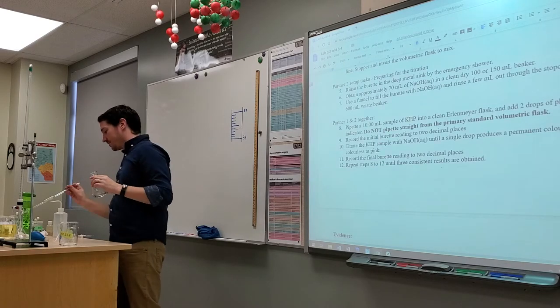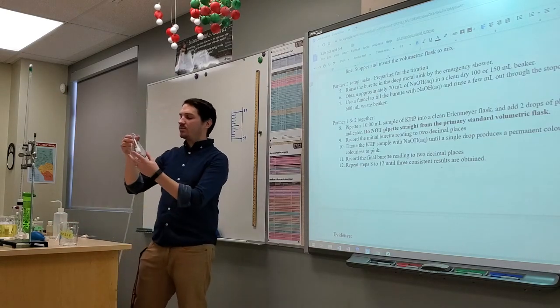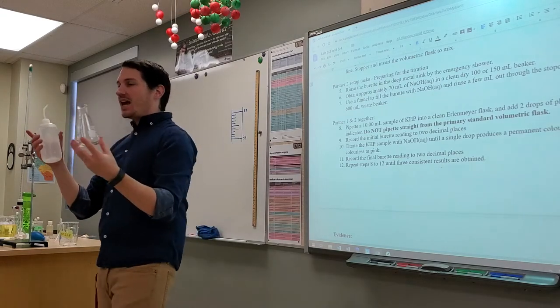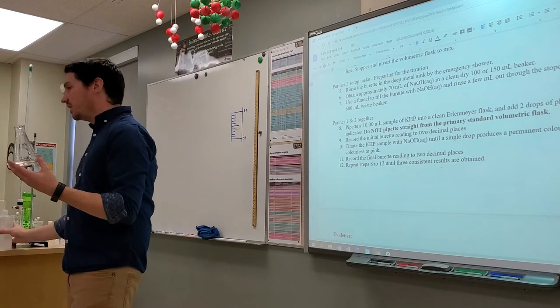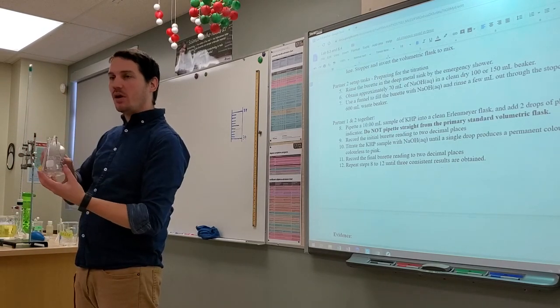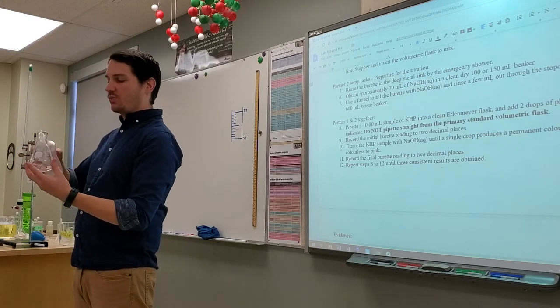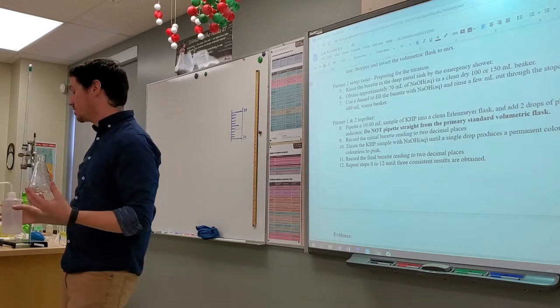Okay, perfect. So now I've got my potassium hydrogen phthalate. Now, I want to ask you, am I going to change the number of molecules of KHP by adding water into this? No. So it doesn't matter how much water you add to this thing. You're not changing the number of molecules of KHP, right?